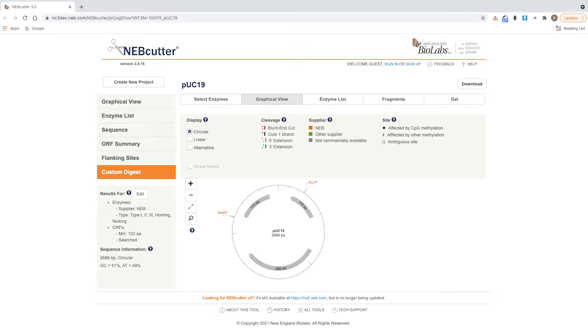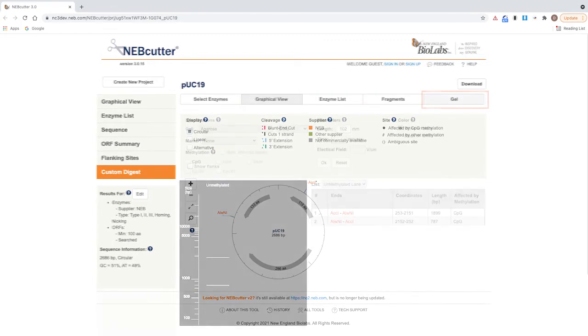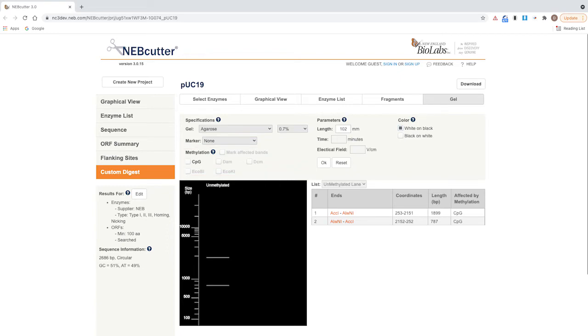The digestion information can be displayed as a graphical view, enzyme list, fragment list, or gel. Gel view will display digestion patterns for unmethylated and/or methylated DNA substrate.